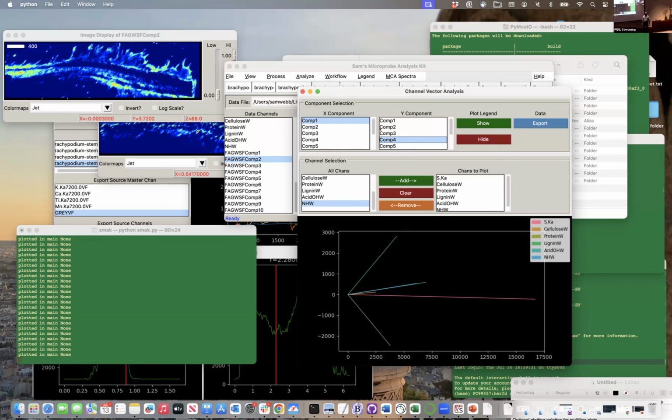So then, in terms of sample prep workflow, is it easier to have some of these markers, like the 300 micron writing, for example? It was not intentional, but it was there. It was very helpful.